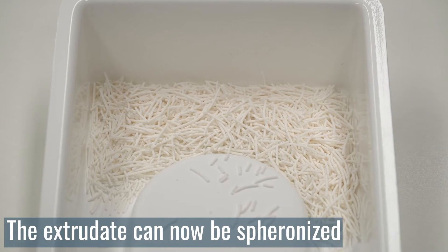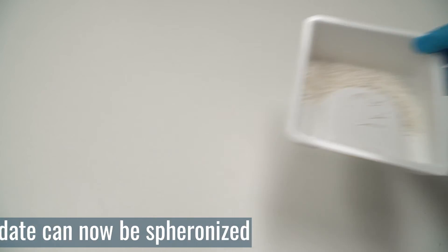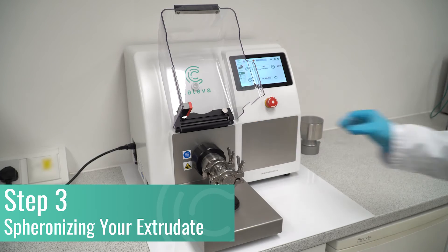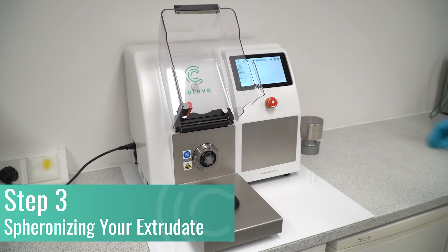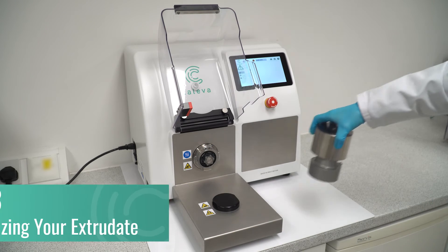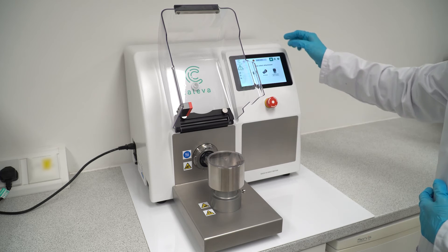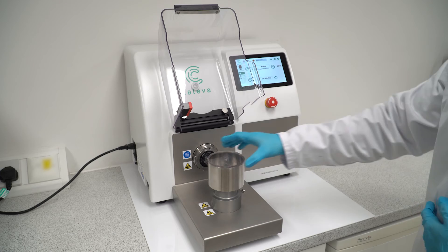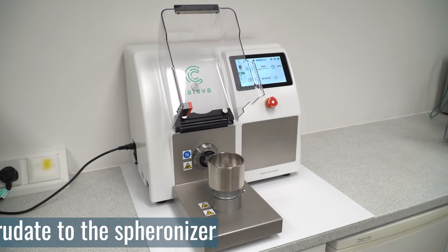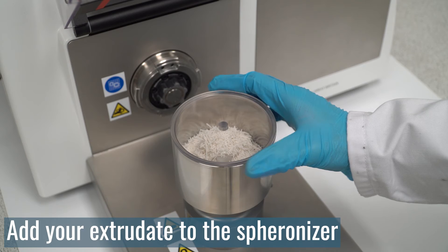The extrudate is now ready for spheronisation. Once extrusion is complete, the extruder can be removed and the spheroniser put in its place. Simply pour the extrudate into the spheroniser bowl, close the safety cover and begin.